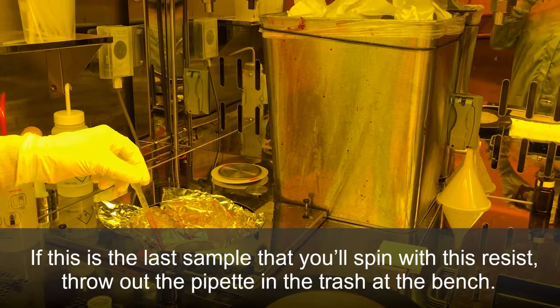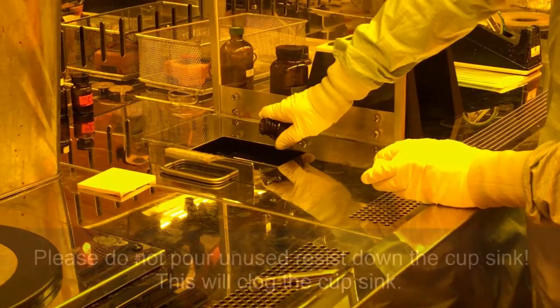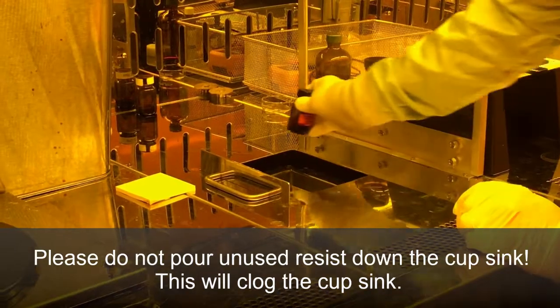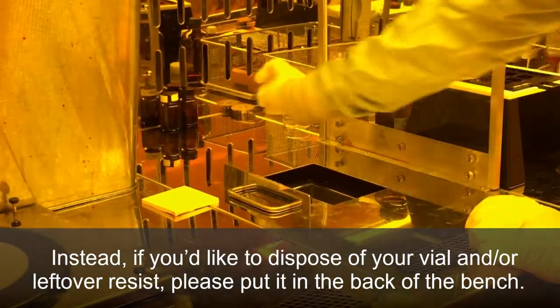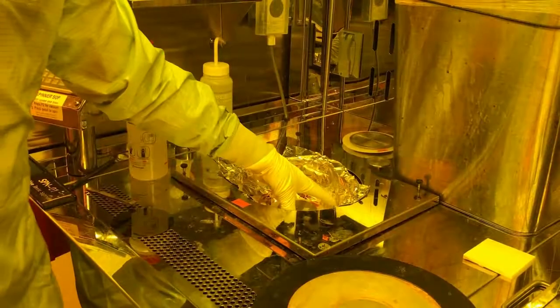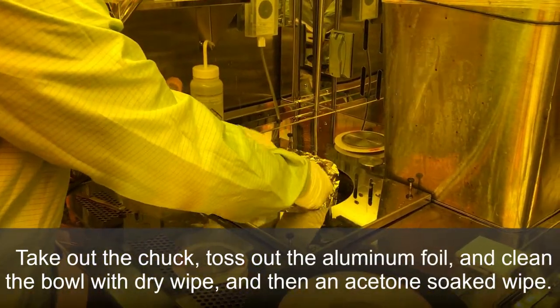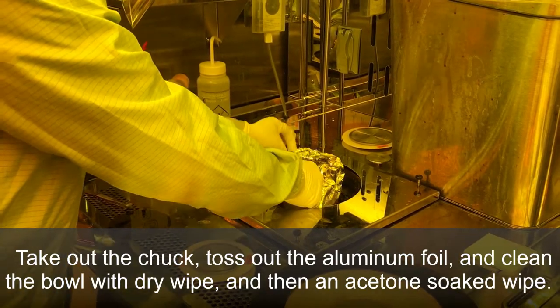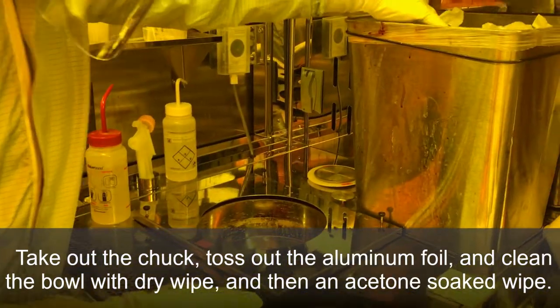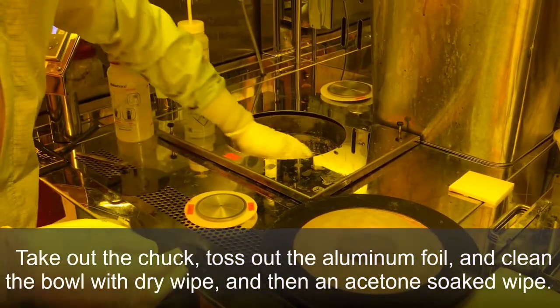If this is the last sample you'll spin with this resist, throw out the pipette in the trash at the bench. Please do not pour unused resist down the cup sink — this will clog it. If you'd like to dispose of your vial and leftover resist, please put it in the back of the bench; staff will collect and clean the vial accordingly. Take out the chuck, remove and throw away the aluminum foil, and clean out the spinner bowl with a dry wipe and then an acetone-soaked wipe.